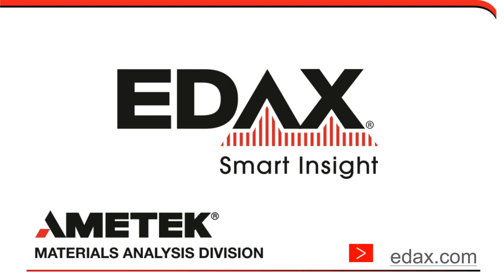The first question on the list says, what EDS detector was used for our simultaneous work? In this case, I was using the Octane Elite Super, which is the detector that has the 70 millimeter squared detector.